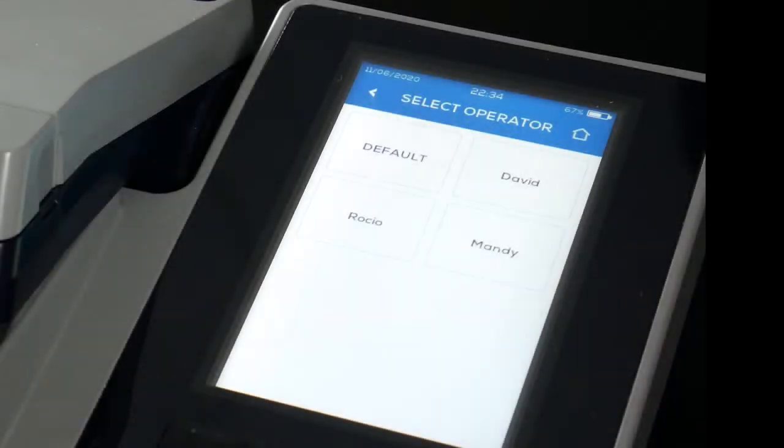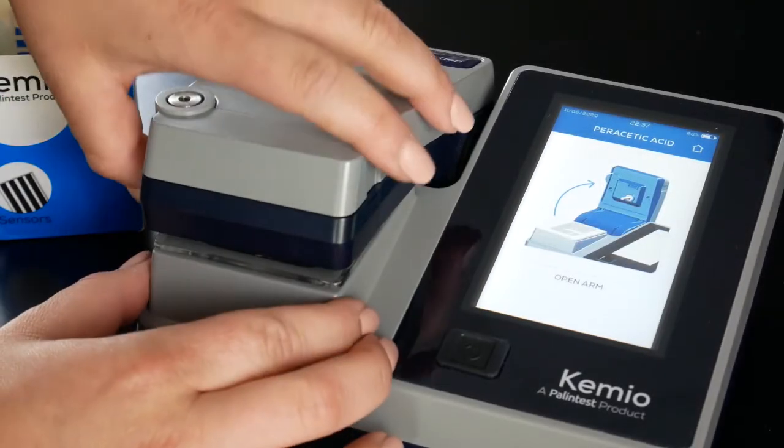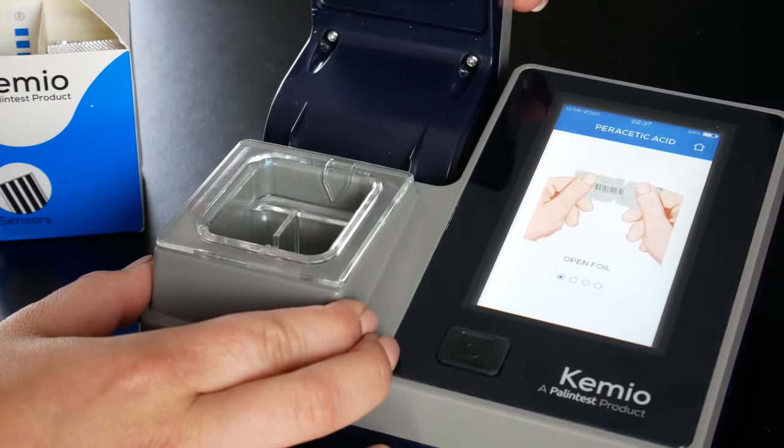If set up, select the operator and label. Open the instrument arm. You will be prompted to insert the sensor.